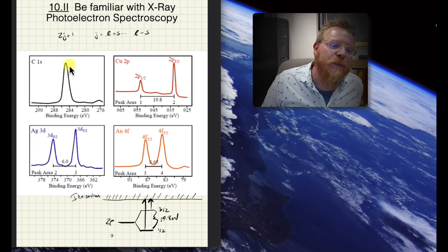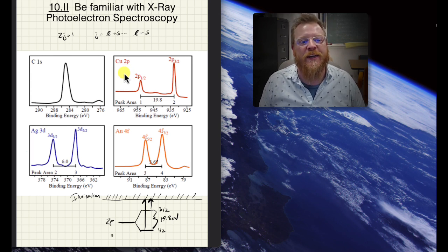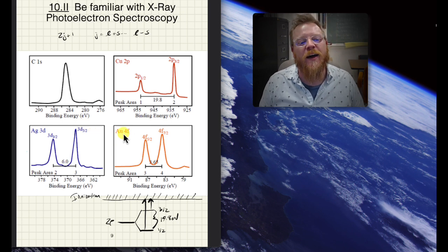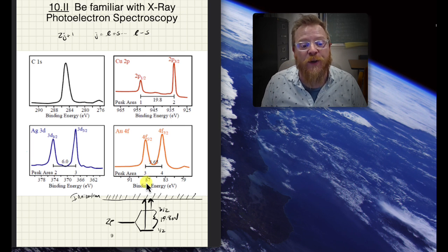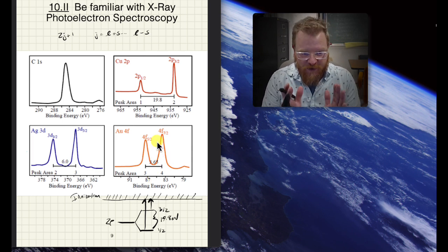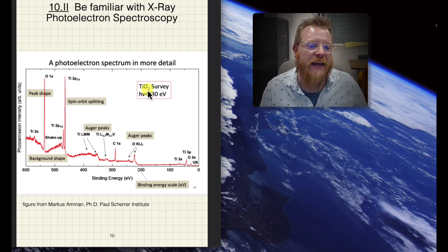Now I know what you're thinking, well, carbon's at 285 and it's 1s, it's very close to the nucleus. So we have to compare apples to apples, right? We'd have to compare the copper 2p to the copper 3d to the copper 4f, for example, assuming it contained those, which it doesn't. So a better example would be to compare silver 2p to 3d, etc. Sorry if that was confusing. Finally, when we get over to gold, the 4f level, you can see the binding energy has gone way down because those electrons are very easy to remove, and the spin orbit splitting has gotten much less. If we now look at what some molecules look like, here's a simple molecule, titanium oxide.